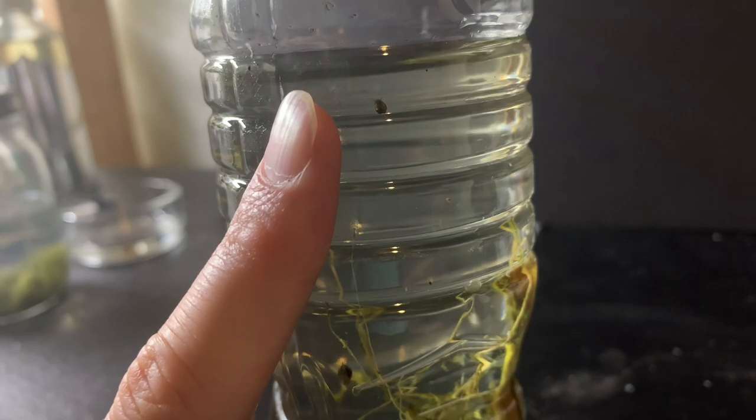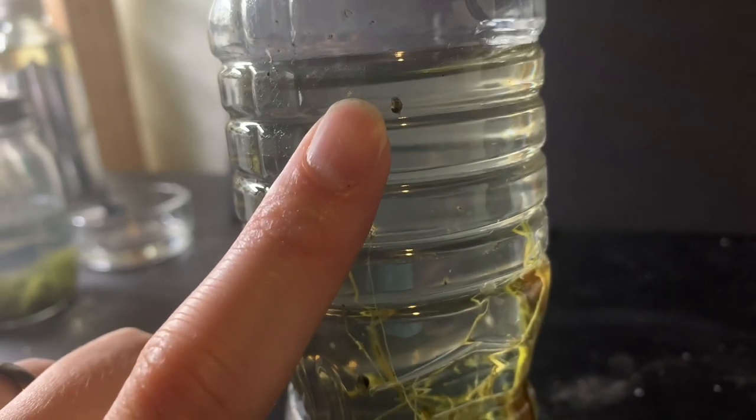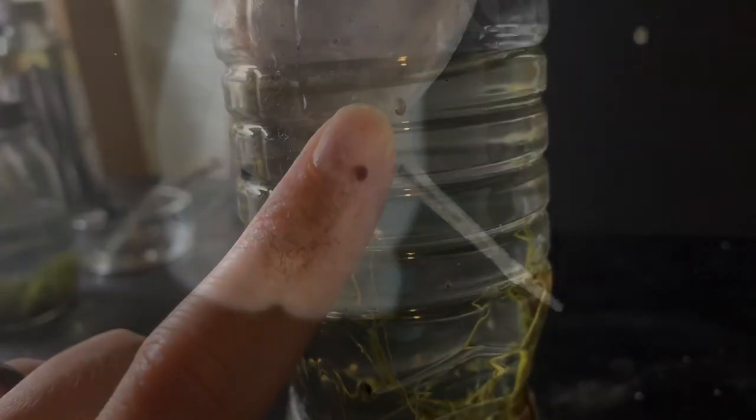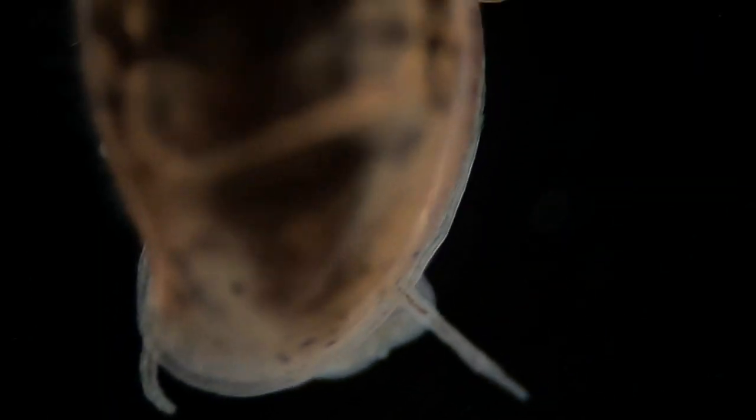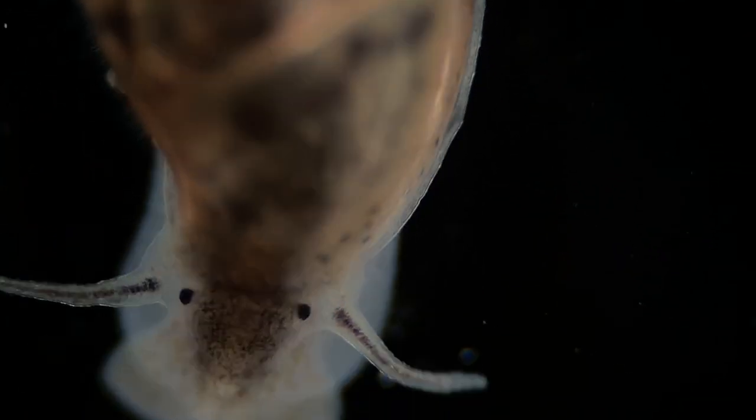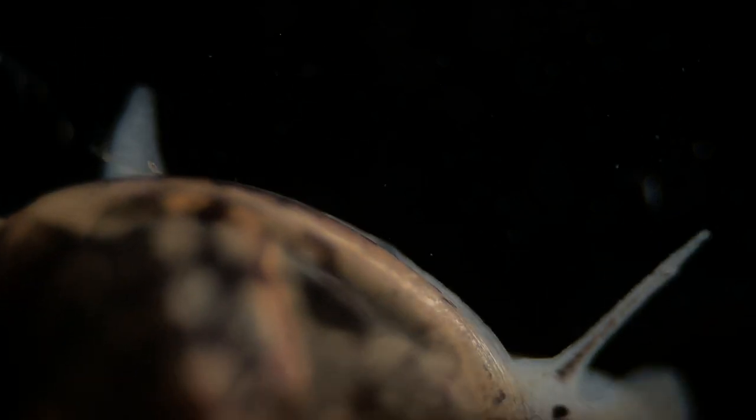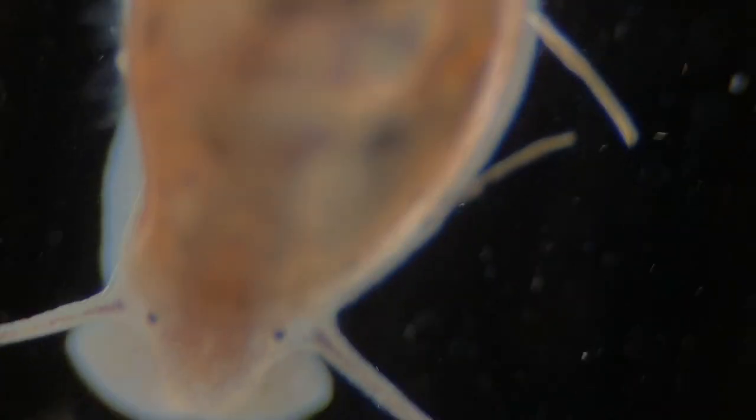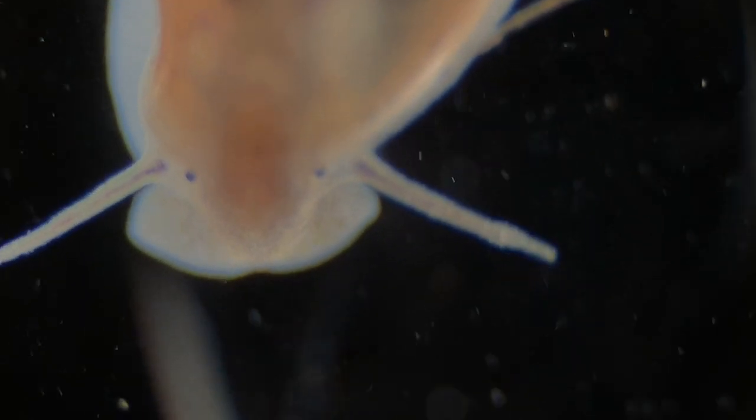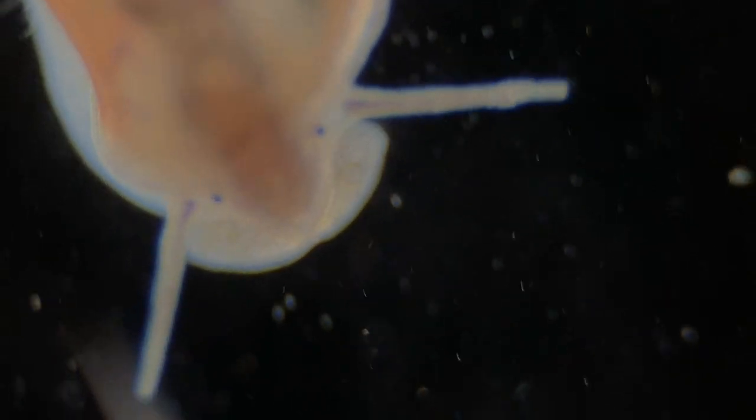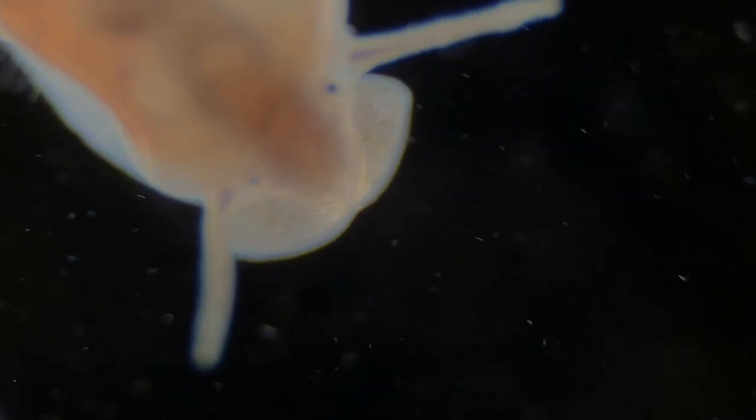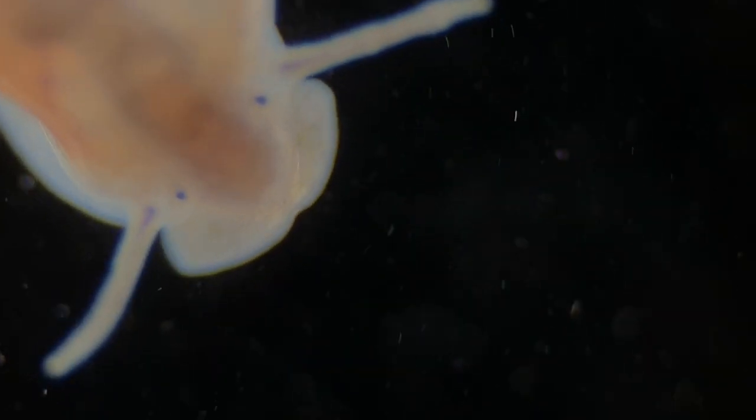As you can see these snails are pretty small. We're going to throw them under the microscope right here and this is at 40 times magnification, the lowest magnification setting that I have with my compound microscope. We're looking at it with a dark field lens and the dark field filter is what makes the background dark and lights things a little bit from the side.